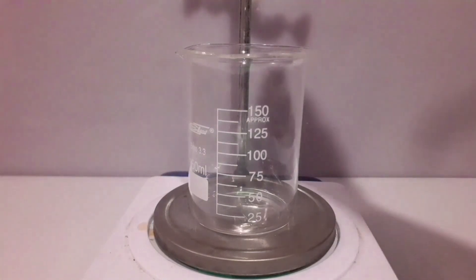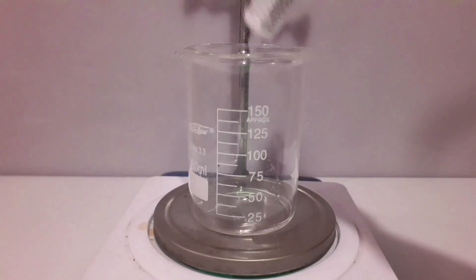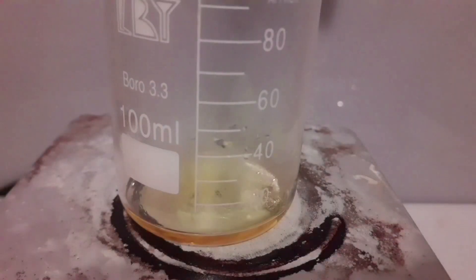Step 3: mix the acids together — just mix them. Then add aqua regia to platinum. Turn on the heating, because this reaction is slow as hell and will probably take about a day.